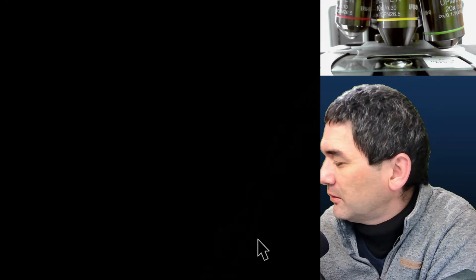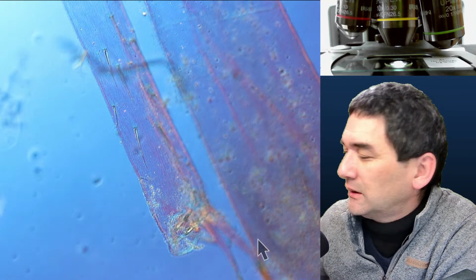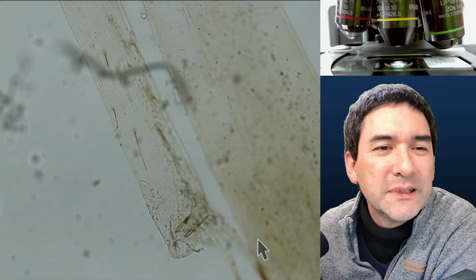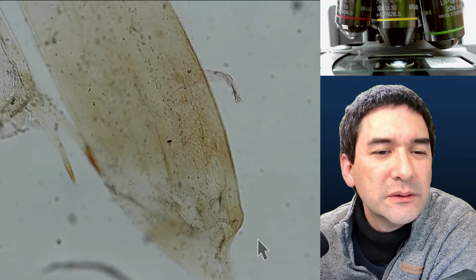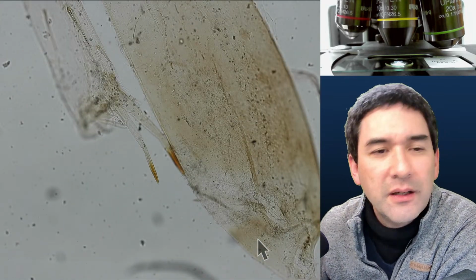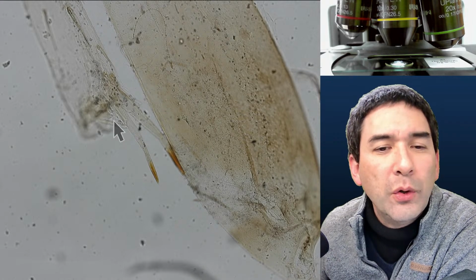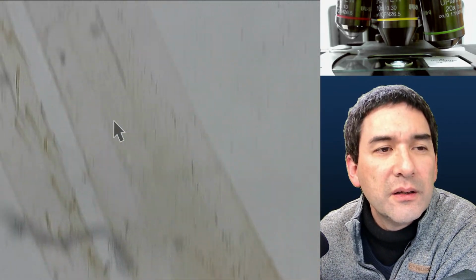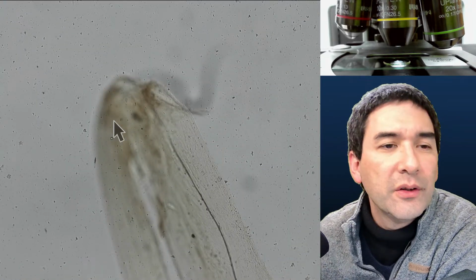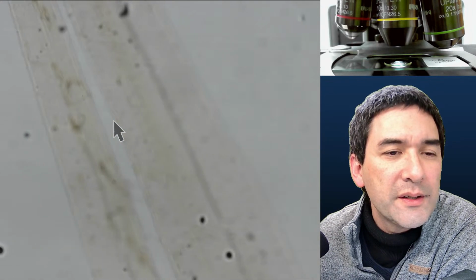Let's do it like this a little bit. Let's go bright field again. And you see the slide's a little bit dirty. So this is pretty transparent again, but we're at least able to see the claws here, which the butterfly uses for holding. And in here you see the joint goes around at the corner, and then on the other side again.